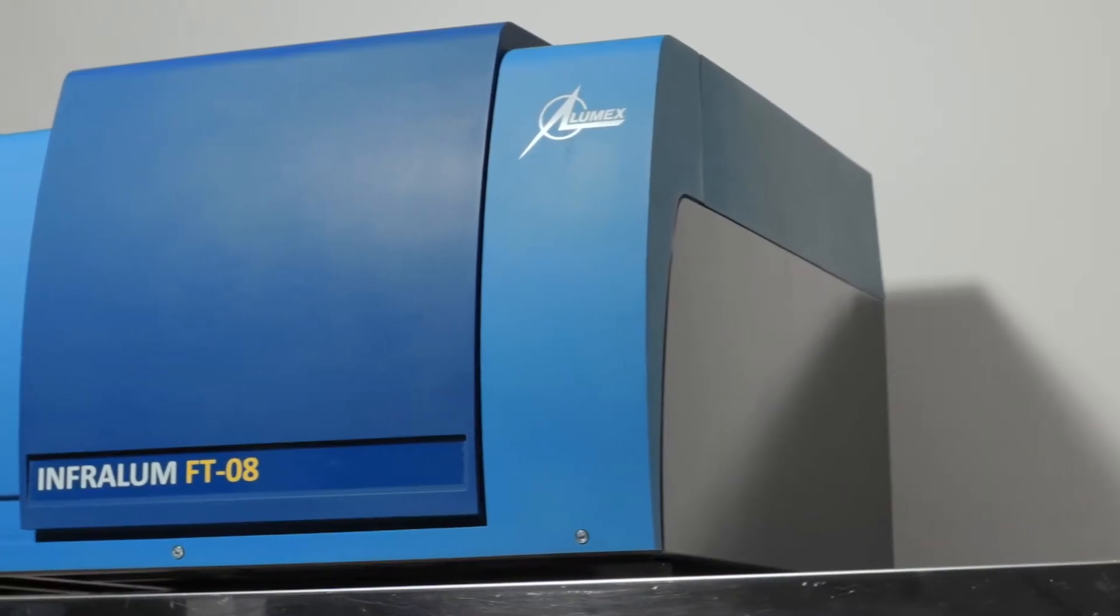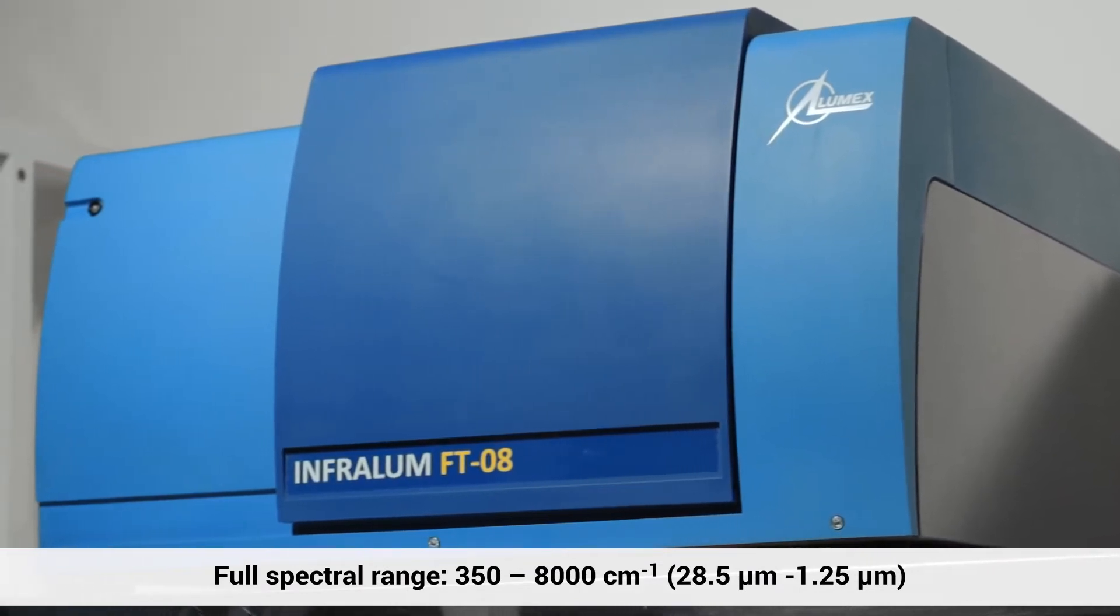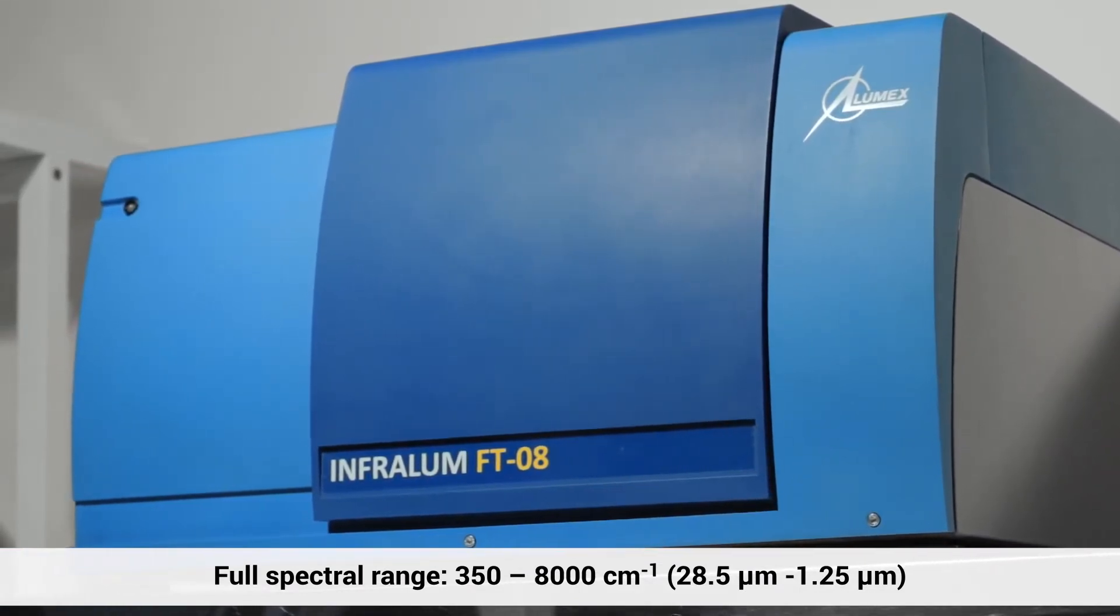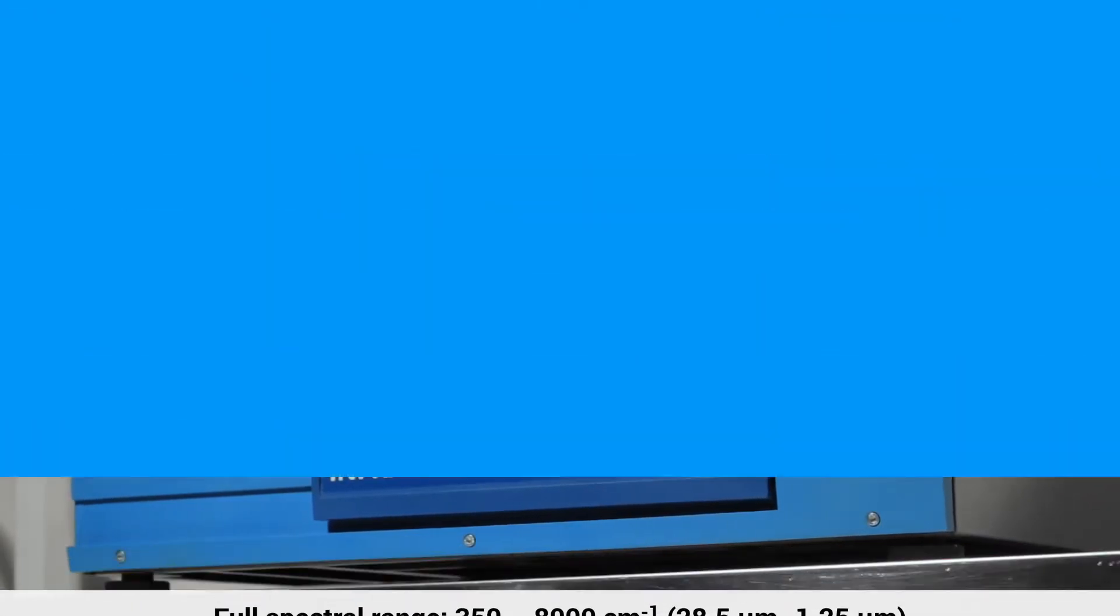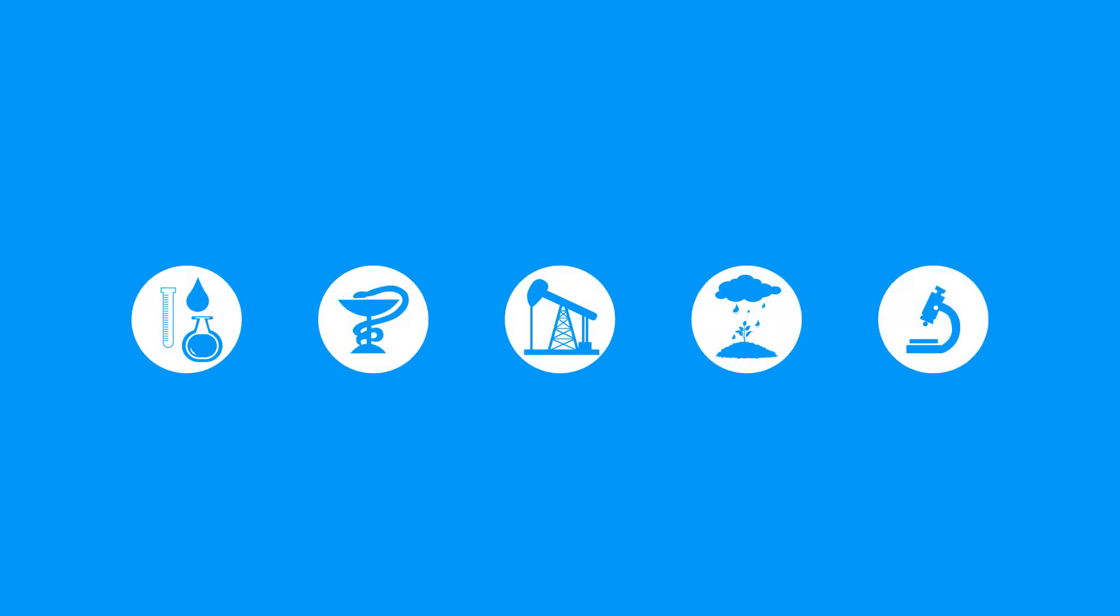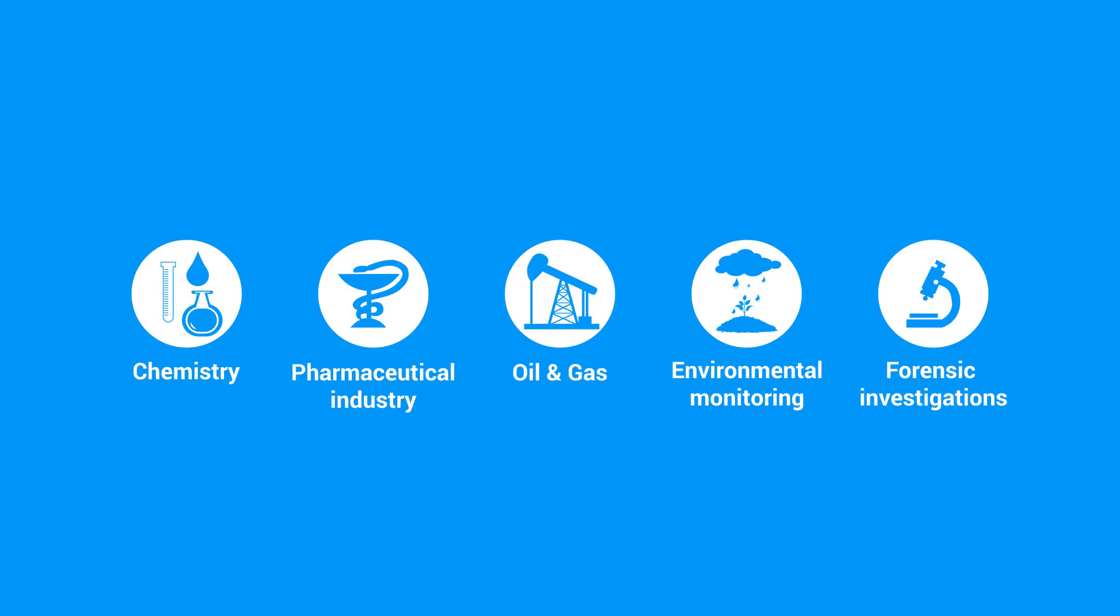Our Infralume FT08 spectrometer provides both qualitative and quantitative analysis to a great variety of samples in various states. As a result, it has wide applications in chemical, pharmaceutical, and oil and gas industries, as well as environmental monitoring and forensic investigations.